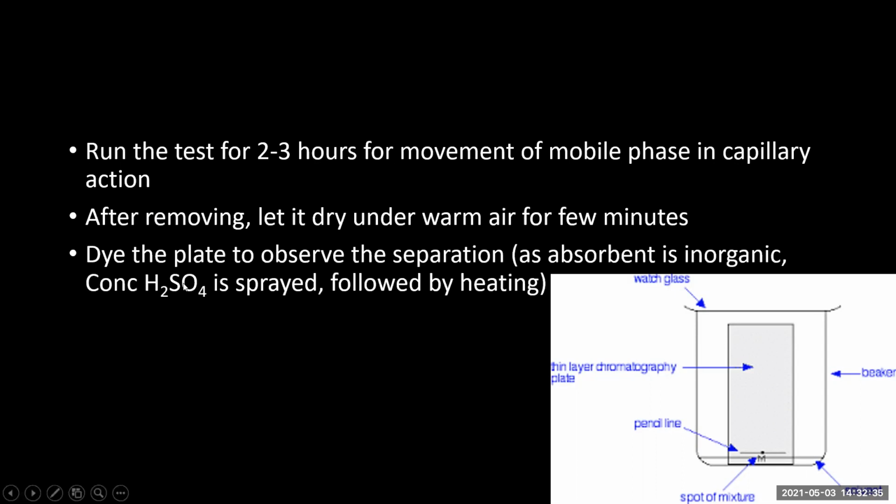Next is dyeing the plate. You have to dye it to observe the separation. The adsorbent is inorganic, so we have to use a stronger reagent. Concentrated H2SO4 is sprayed, followed by heating of the surface.